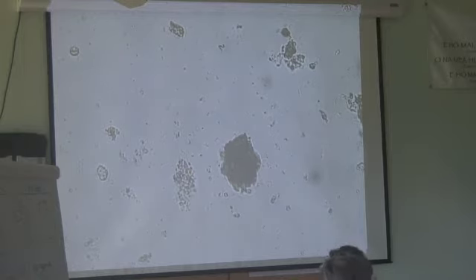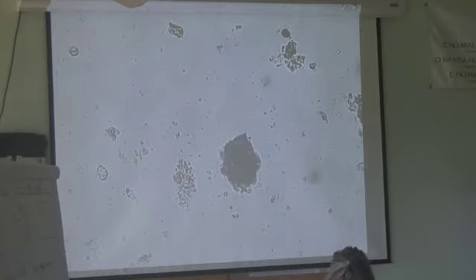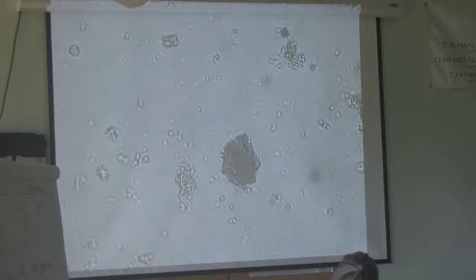Lactobacillus can be motile, almost like a dolphin moving through the water. Sometimes when two of them get together, they'll flap like a bat, and they look like bat wings flapping through your sample. We're looking for the real slender characteristic of lactobacillus. If this thing was 2 or 3 micrometers wide, real long and narrow like that, then we would call it bacillus. So there are your differences. So far in the sample, a couple different kinds of bacteria, but not a massive amount. So there's another, and that's probably one lactobacillus, and then there's the second.